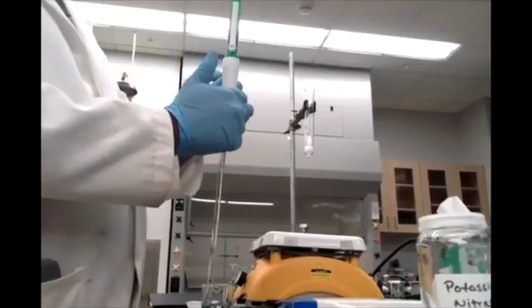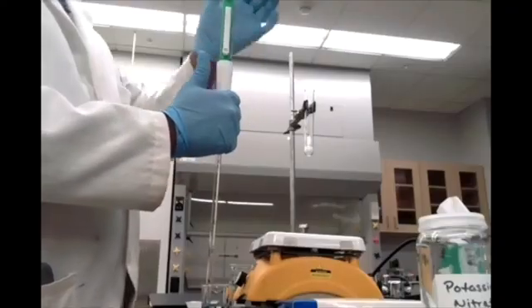So you've got to get ready. I have my thumb ready to cover this. I'm going to pull my pipette bulb straight up.